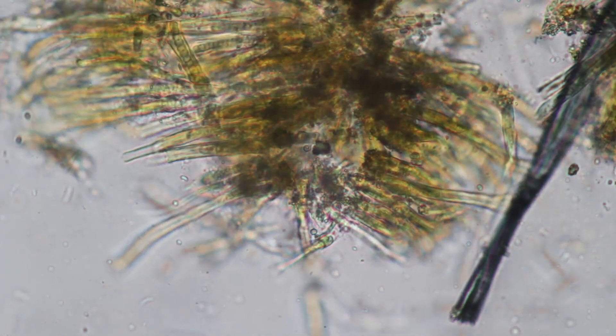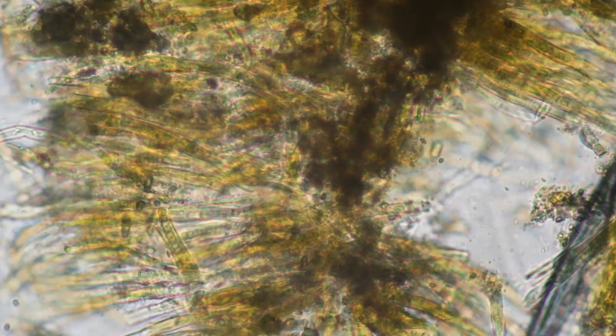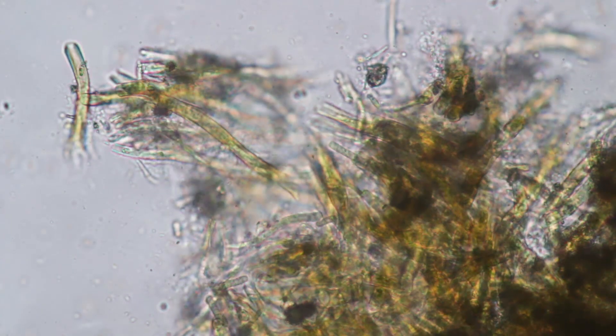The diatoms are a little bit difficult to see because they're significantly smaller. You can also see that these algae are bundled together because they grew on a surface, and as I scratched them off these bundles stayed together — that's basically why it looks the way it does.